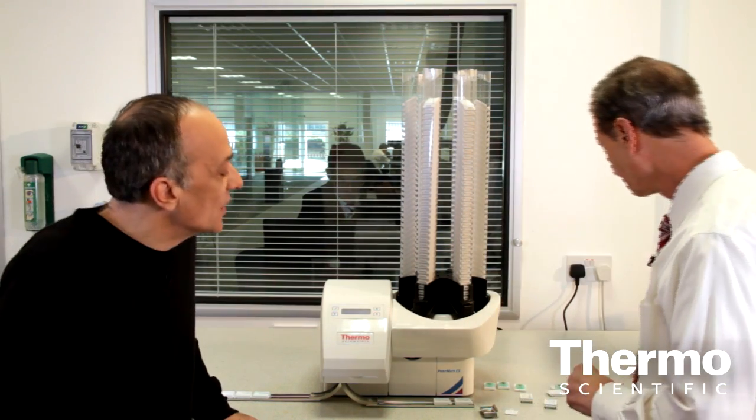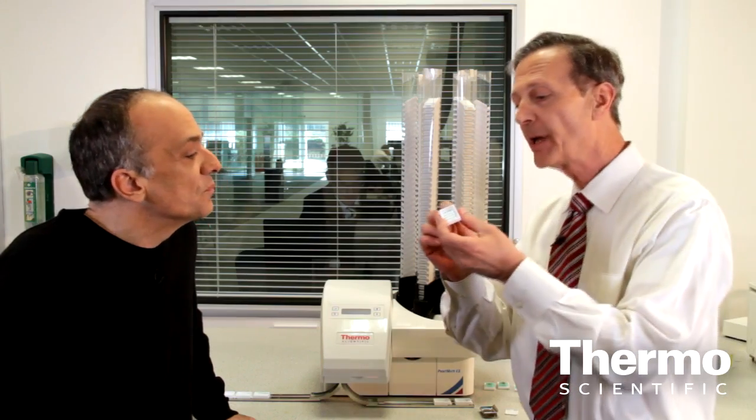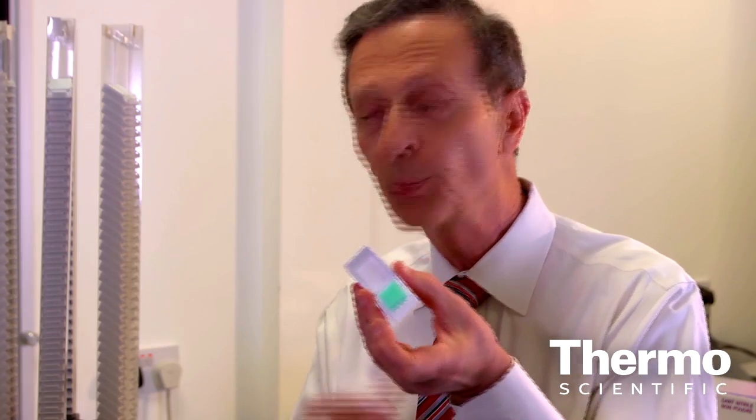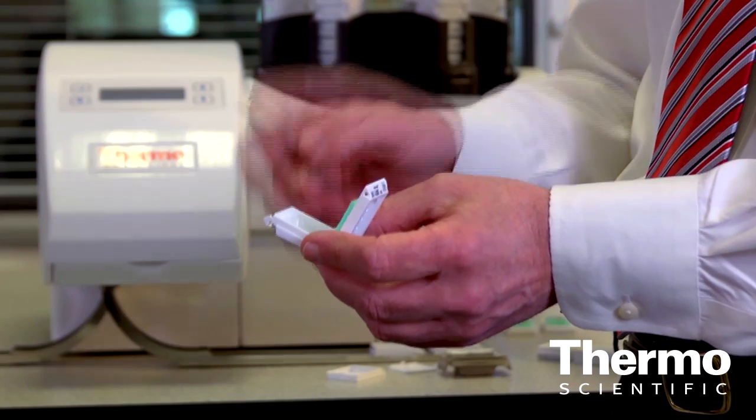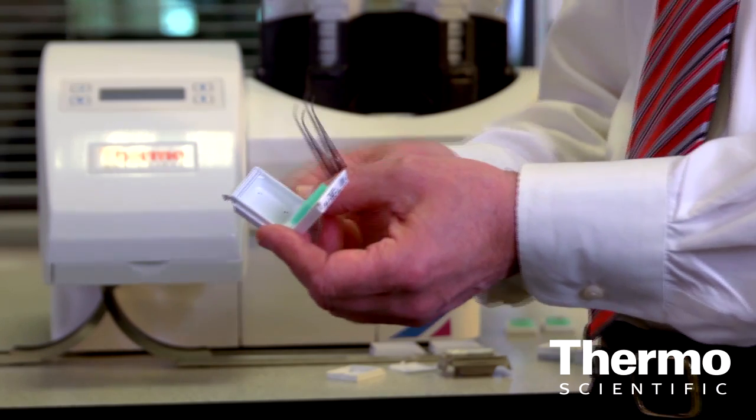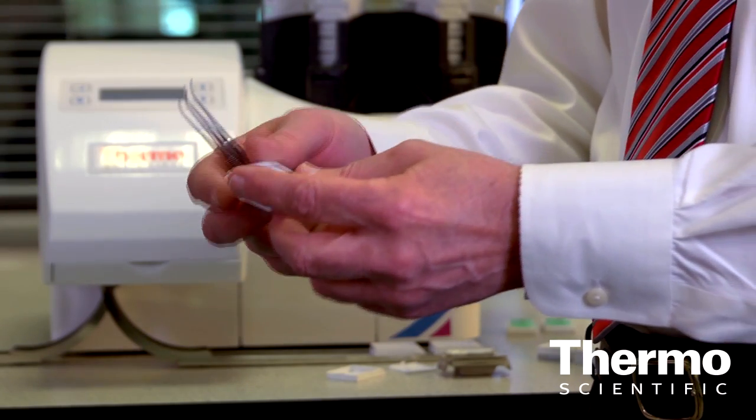Show us the new technology. We call this SecureSet. This is the new cassette. You don't need a separate base mould, which needs cleaning by the way. It's integral inside here. When the tissue's placed in here in the right orientation, the foam holds it in place during processing so that it can't move around.